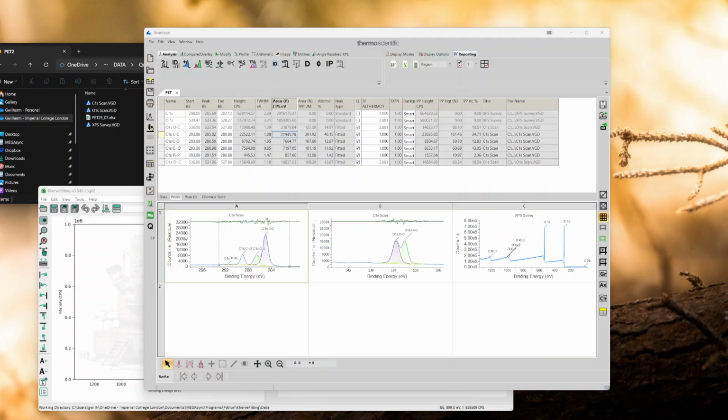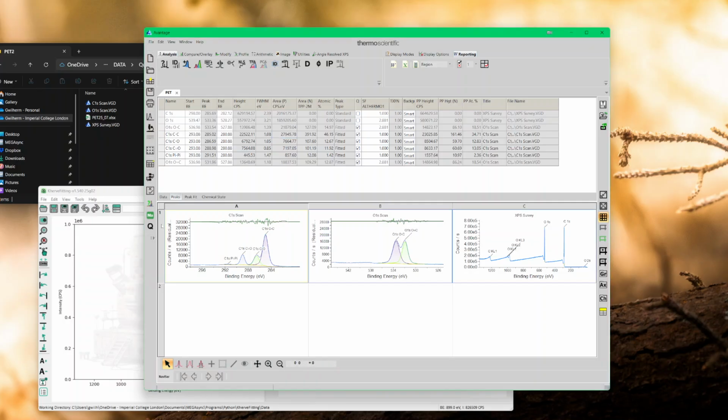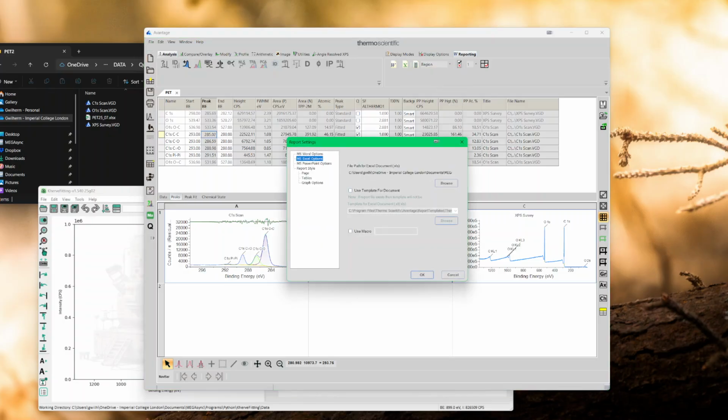So how do we first export data into Excel? Let's select the three, so those three are selected. Then we can go into reporting, and in reporting we should see this report to single without any names written here. If there is a name, you go to report options, and in report options you should remove absolutely everything in this location, and that will give you the empty file.